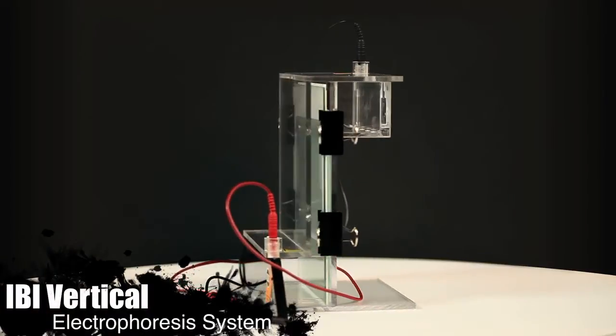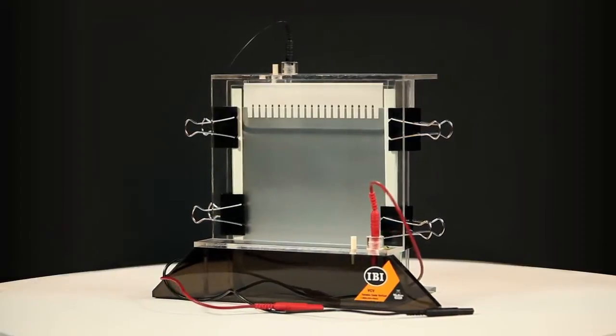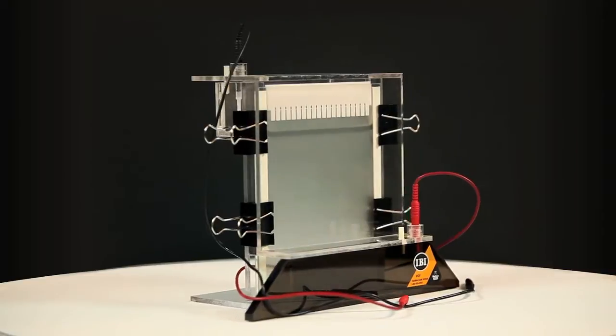The IBI Scientific Variable Comb Vertical Electrophoresis System is designed for high resolution and rapid analysis of protein and nucleic acid samples in an 18 x 22 cm format.